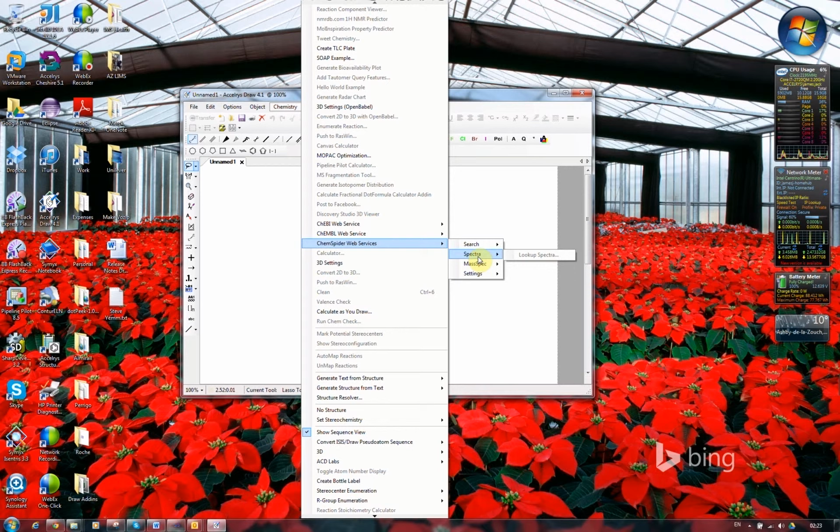Then on Facebook today, I came across a paper that Tony Williams from the RSC had been a co-author on, and it was all about the new MassSpecAPI. So I decided to add another add-in which is using that. This is the menu for it. So you can search by composition or mass, and the UI is slightly different in each case.